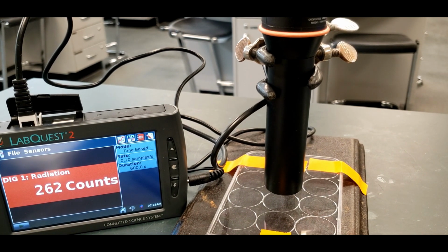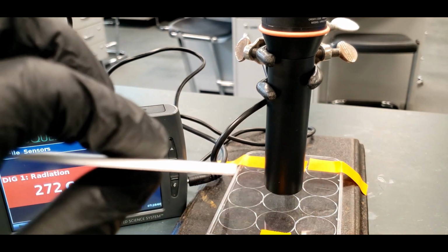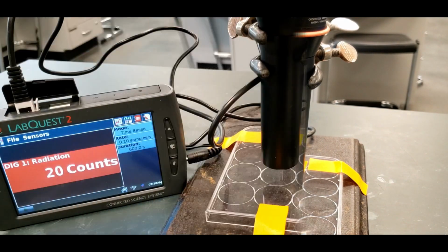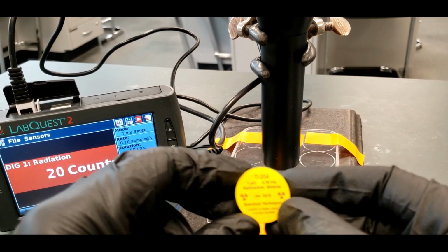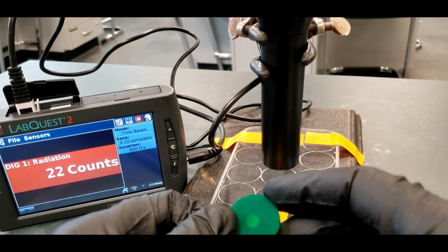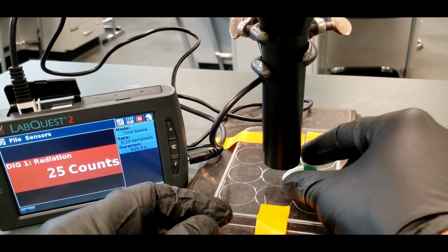And again, just to show you what you need to block this kind of radiation: for alpha particles, you don't really need much. Even just a thin piece of plastic can block quite a bit of the alpha radiation. Okay, here's the thallium-204. We're going to do the same thing that we did for the alpha source. So this is our beta source. I'm going to put it here.